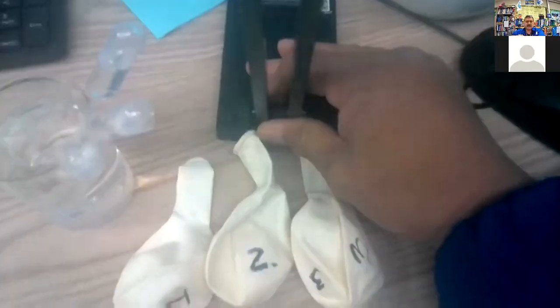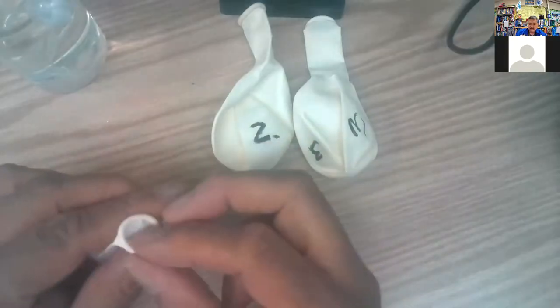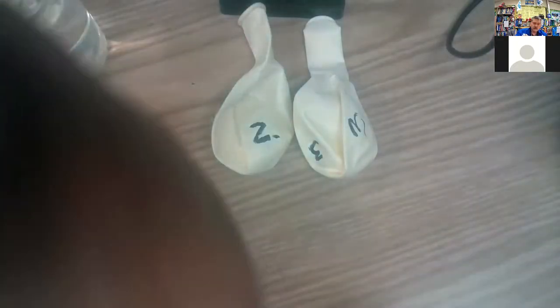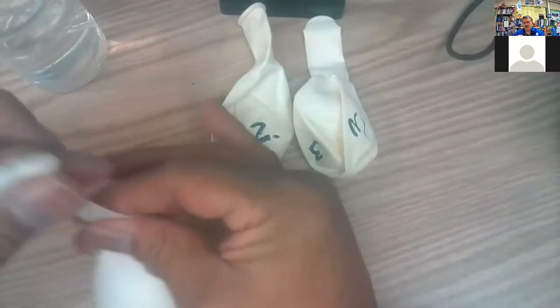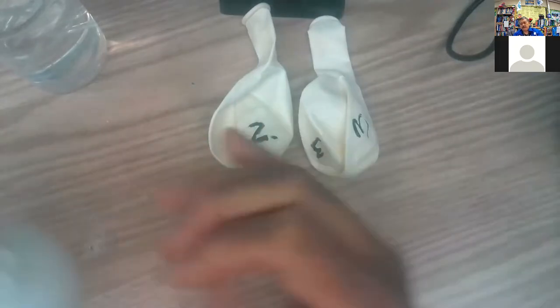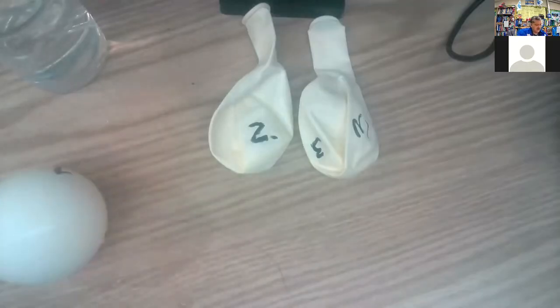Okay, so let's see that. Are you ready? Okay, here we go. One. Squeeze that one too. Oh man, I have a little bit coming out already. I'm just gonna tie that off. Okay, here we go. We can take a zero measurement if you want to do that.